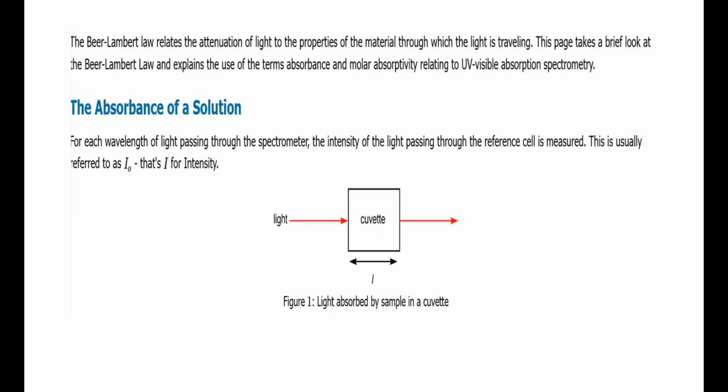You also keep reagent blank, right? This is just to nullify the absorbance of light due to the medium, that is the aqueous medium. Then the color, or the concentration of the reagent that is added, if it remains unreacted with the sample, should be nullified. Its absorbance is to be taken care of so that you can quantify the analyte under study.